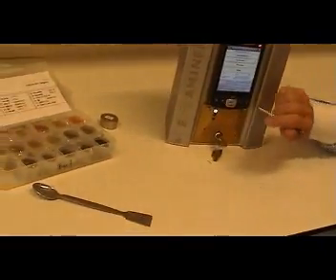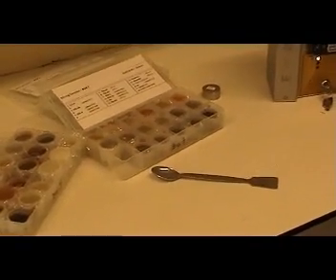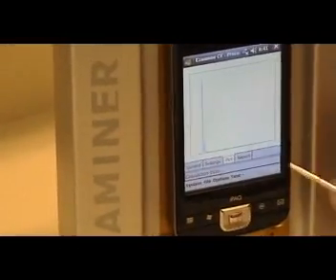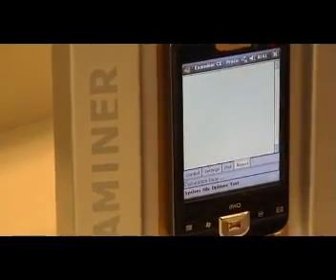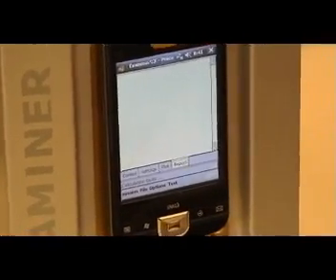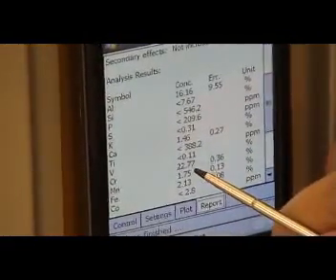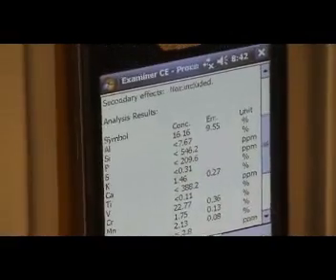The calculation is busy. We already can see a plot — of course, this plot would be much bigger on your computer screen. Once the calculation is over, the report will be automatically saved and displayed here. So again, we are measuring chromite. What do we find? Indeed, we find about 22.77%, which is approximately 23% chromium.